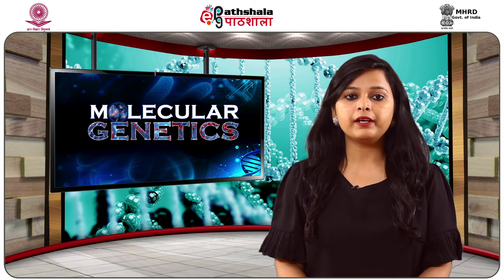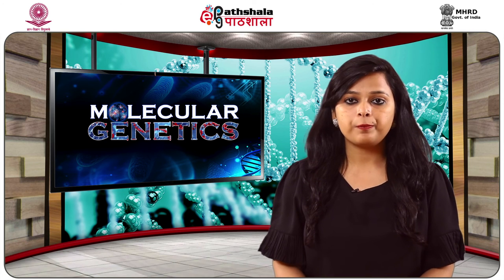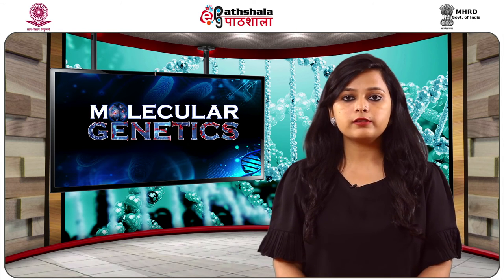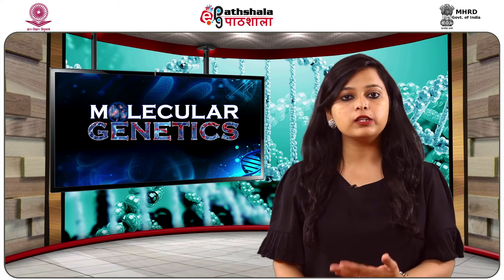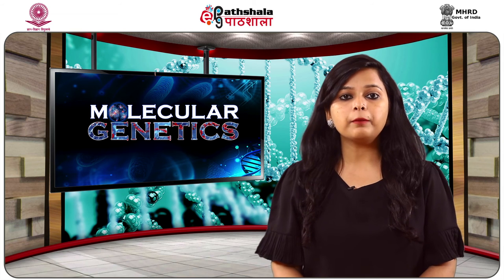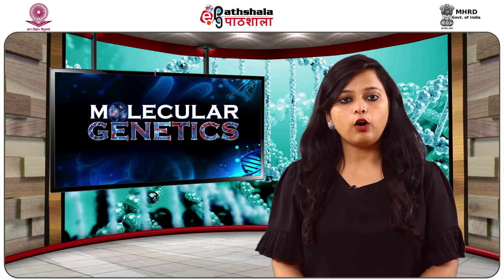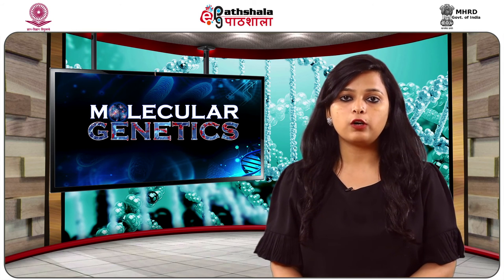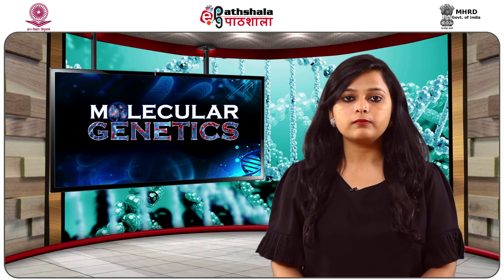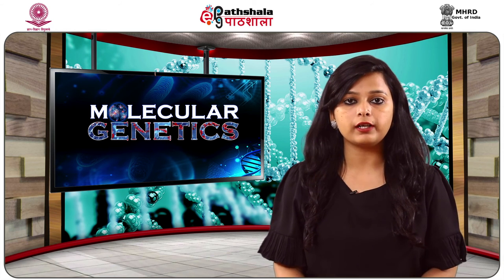During the hybridization process, stringent conditions are kept to facilitate specific probe-target association. This stringency is established first by the salt composition of the hybridization solution, since the probe-target hybrid depends on the ionic strength of the buffer used and the high temperature at which hybridization is carried out. The melting temperature, Tm, is the highest temperature at which the probe-target hybrid is stable, and for a complete base-paired complementary sequence it is high as compared to non-specific hybrids. Therefore, the correct combination of salt composition of the buffers used and temperature plays a crucial role in obtaining desired probe-target hybrids.